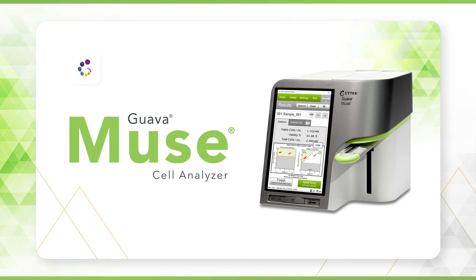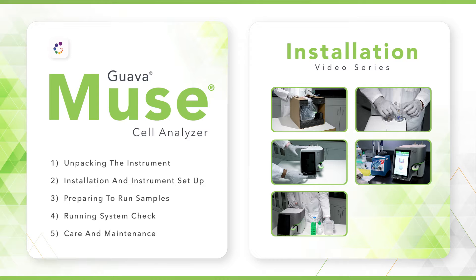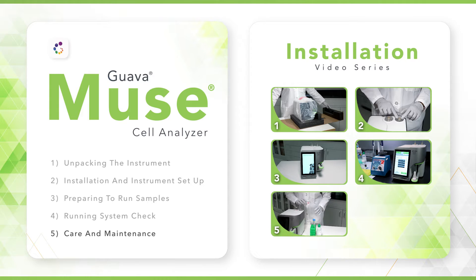Welcome to the installation video for the SciTech Guava Muse Cell Analyzer. This video series is divided into five chapters to guide you through the setup and operation of your instrument so you can get started quickly. We will take you through, step by step, the following topics: unpacking the instrument, installation of key components, preparing to run samples, running system check, and general care and maintenance tips. Please review all chapters of the video before you begin.